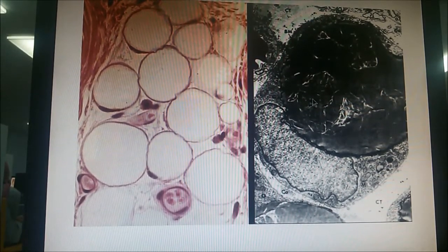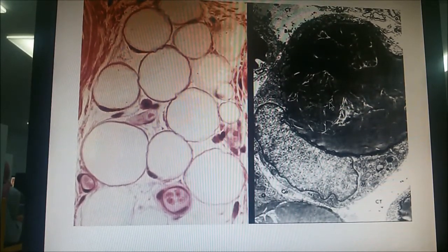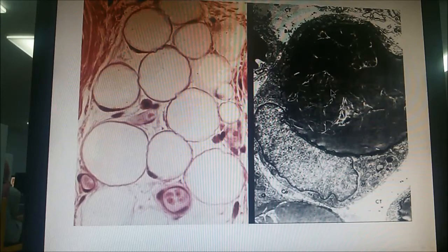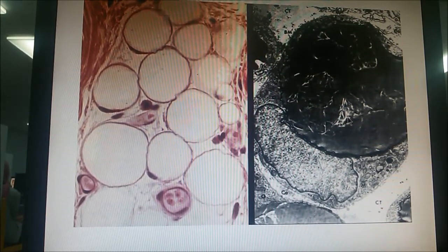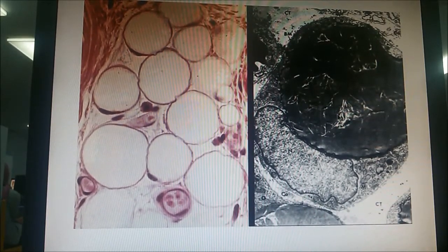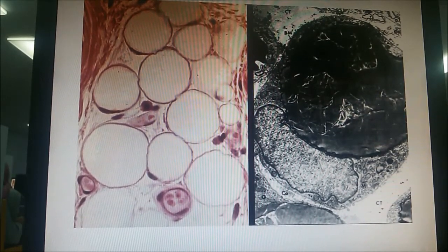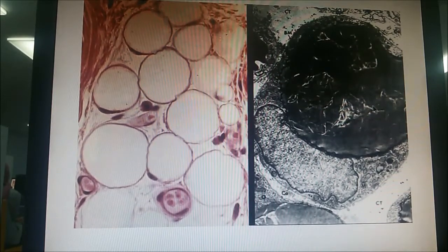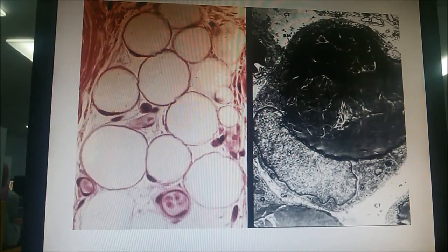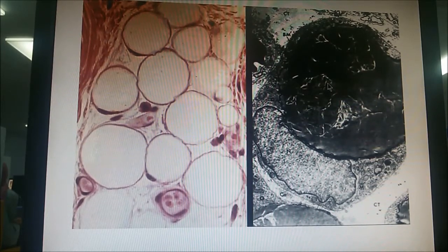On the section to the right, what is that? This is not a light microscope, this is an electron microscope, obviously. Is it transmission or scanning? And how to know? Because you see the nucleus? Yeah, 2D, exactly, as we said. With the transmission electron microscope you take a normal section, it appears 2D, and you see the organelles inside, the nucleus, the cytoplasm and its contents. The scanning electron microscope only gives you the surface of the cell, a 3D appearance of the outer surface. Here it's clear that it's a normal section where we see the organelles, 2D not 3D.